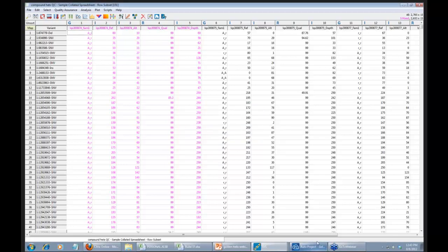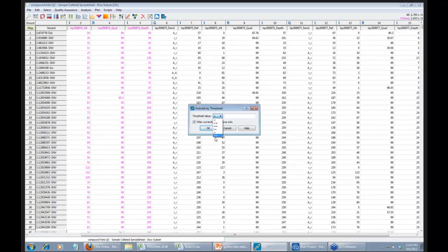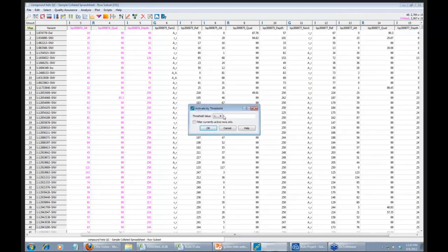And we can do this for the other parent also. So it takes us down to about 2,500 candidates.